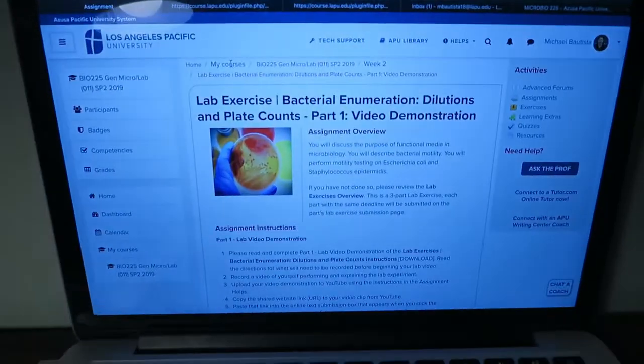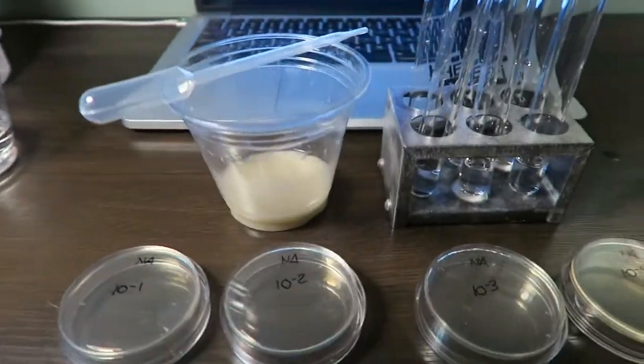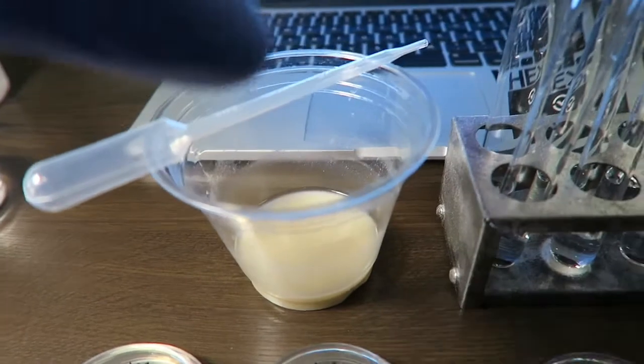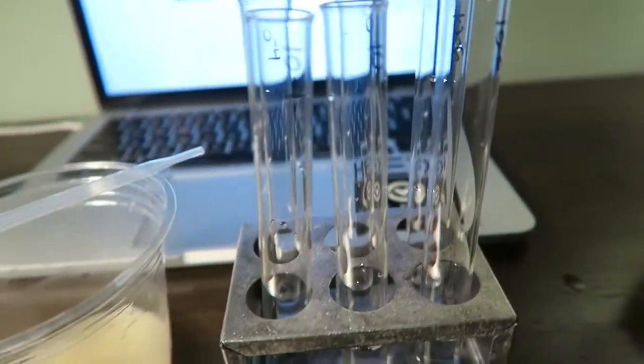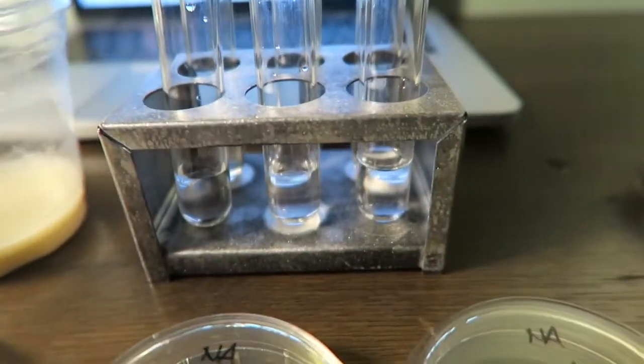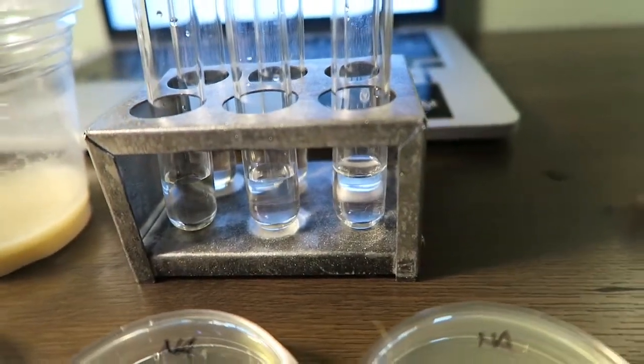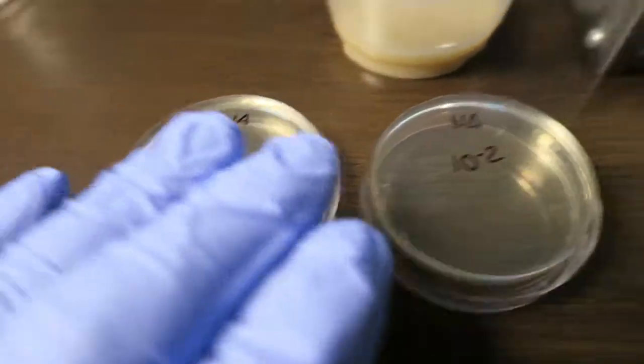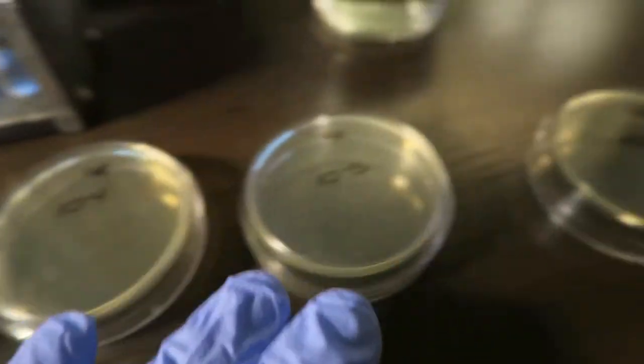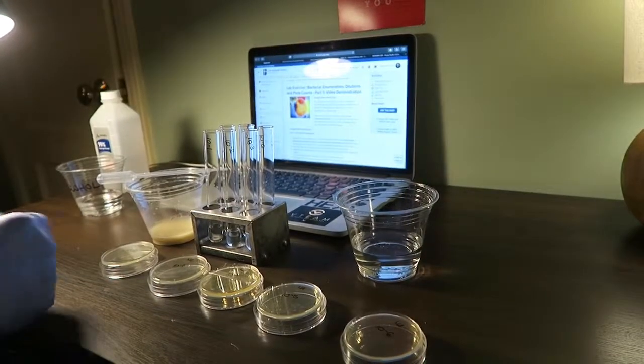We have the Saccharomyces cerevisiae in this cup, and we have six test tubes already with 2.25 ml of distilled water. And then we have the agar plates, six of them. Okay, so I'll be set up right here. Let's get these going.